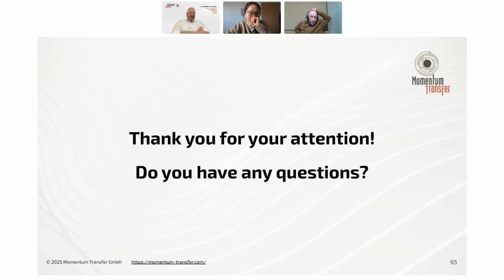So we'll be a little bit more limited in terms of what you have in the database, but we'll also be connecting the PDF database to that as well. Of course, then you'll have to have a license to the PDF database. But I hope that will help streamline search-match applications for data that you collect with us. And we'll probably let you use it on data not collected with us in the near future as well, but we have to make some modifications to make sure it's working well for you.